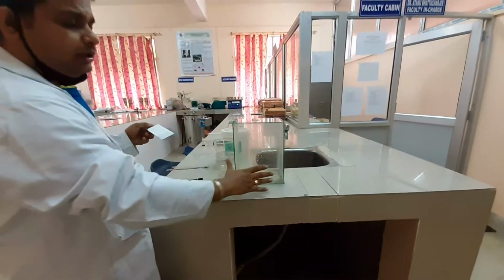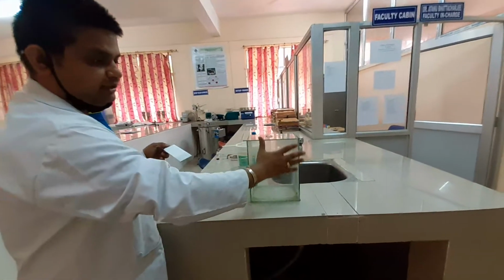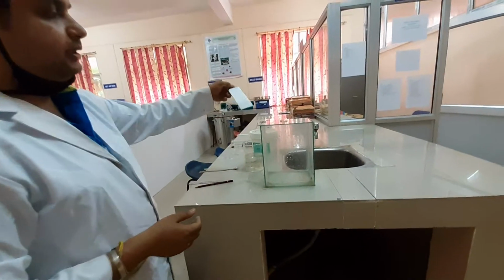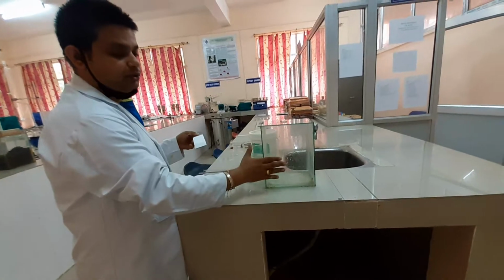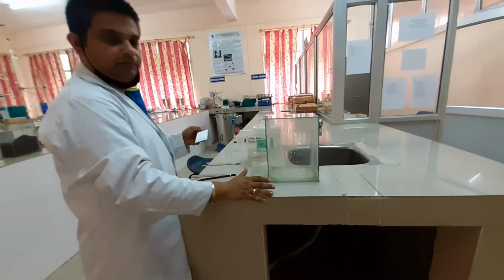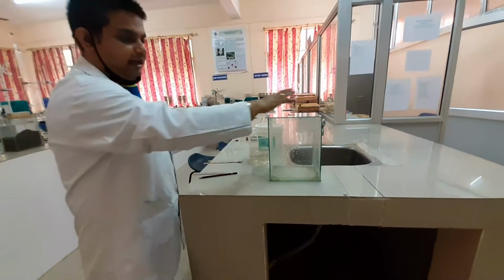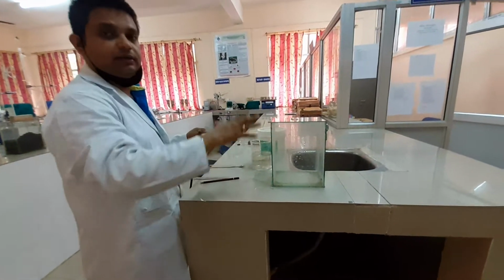This is called the TLC solvent system chamber. Before keeping the plate, always remember your chamber should always be in saturated condition. You put all the necessary solvent mixture together and wait for some time so that the entire atmosphere of the solvent system gets saturated.